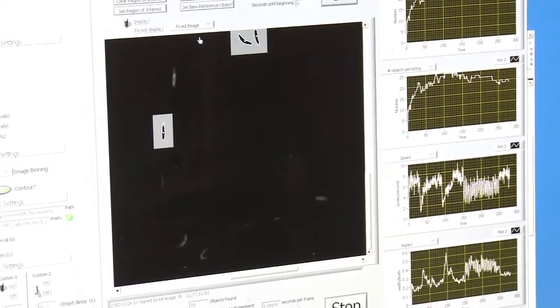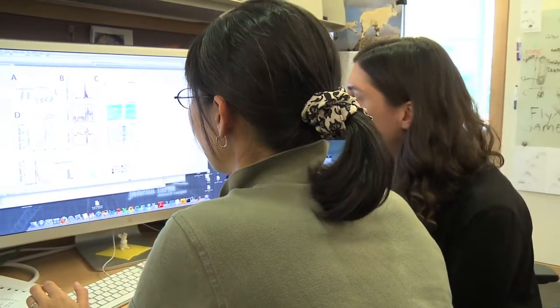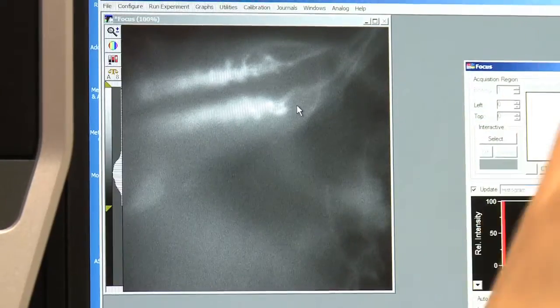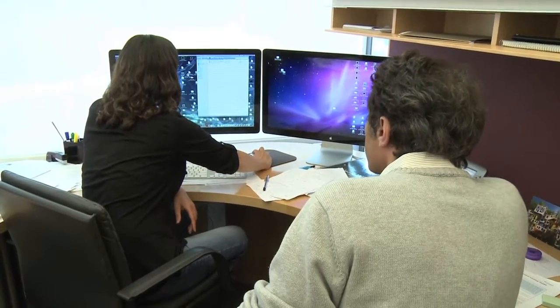We have three experiments going on at the same time now. These lines are lovely — much thinner. Maybe it needs to be just louder. We need to run the heat detection pipeline first to produce all the data. We need to look because there was some bug — I may need to rewrite.